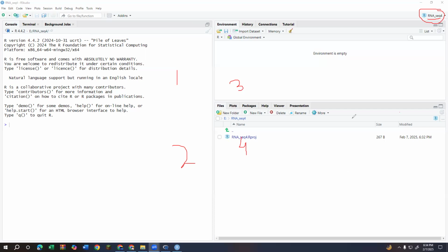Only 3 participants have typed done. If you are facing any issue or unable to create working directory, please let me know so that I can assist you.